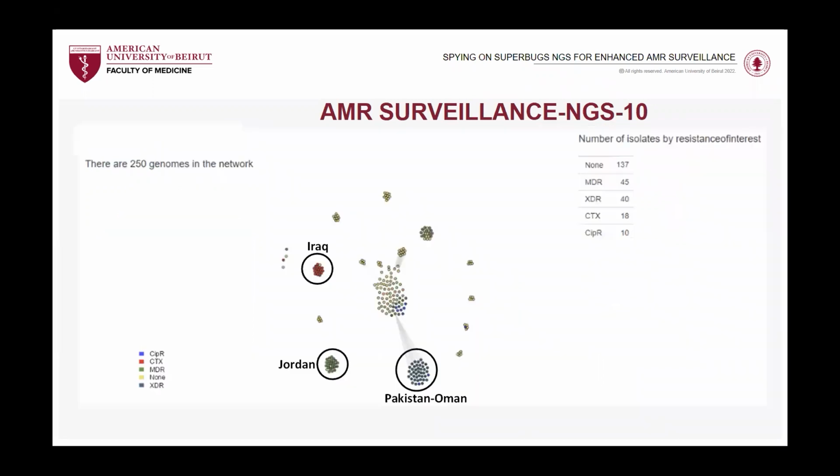We also managed to cluster them not only by genomic relatedness, we can actually look at their AMR determinants and see if those genes are related. Because a CTXM gene or an OXA gene, say OXA66, has a limit of what SNPs they can have, right? What single nucleotide polymorphisms they can have. So we can actually check if these OXAs are all related or these CTXMs are all related. And we actually managed to do this using this method.